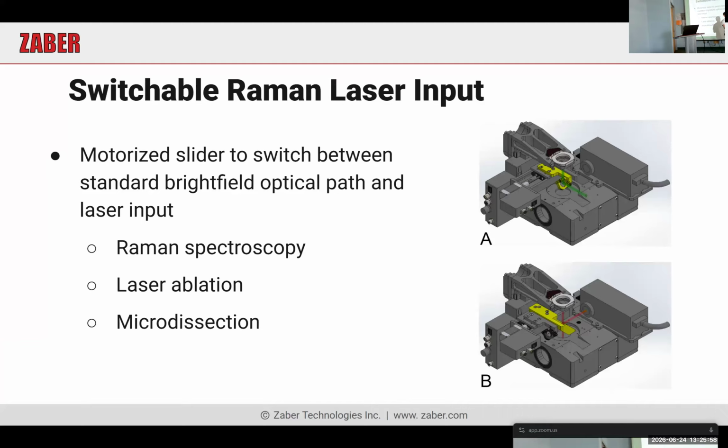And that's something that's really nice about those really high repeatability Zaber stages, is even when you're working at high magnification, you can save a lot of time by just doing the full area in one imaging mode, switching to the next, and then doing the full area in the other, and knowing that they're going to line up nicely, rather than having to do each point and switch between modes for each point.